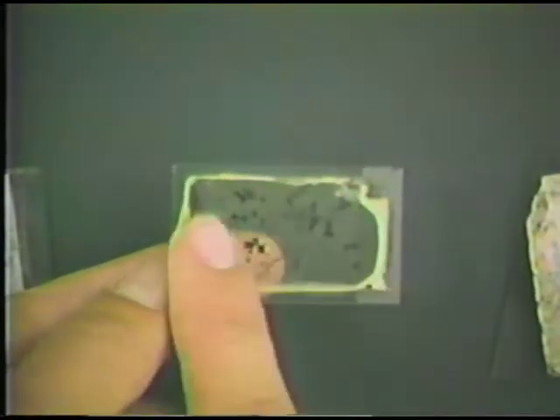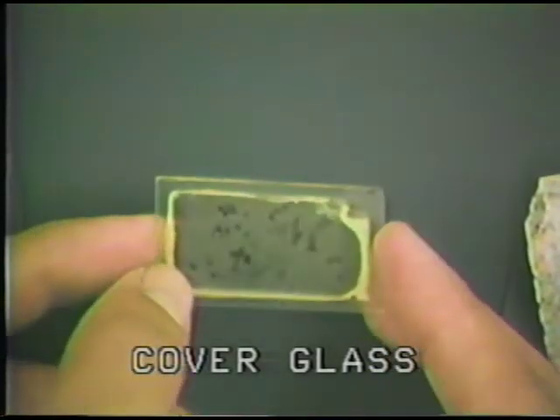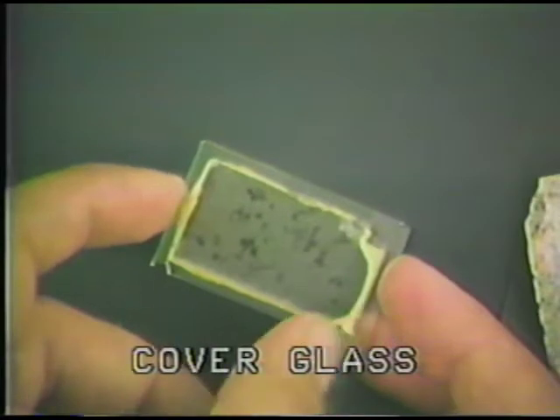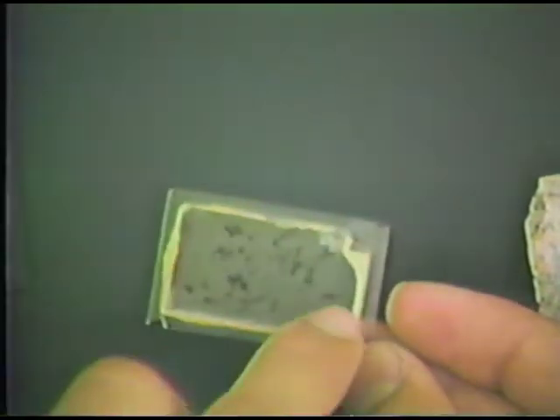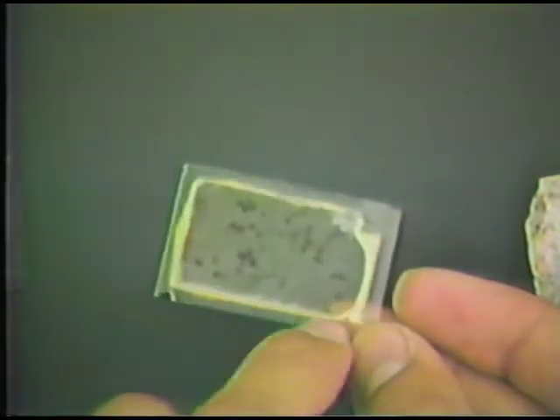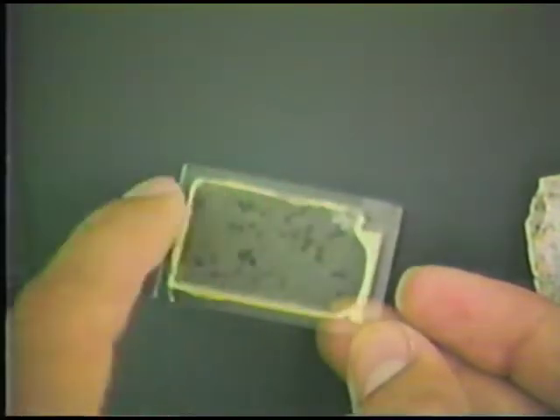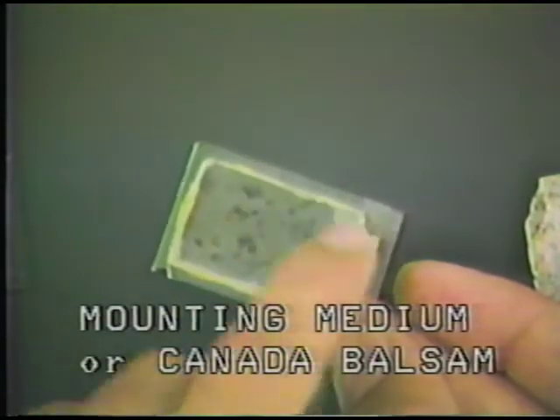The other thing about this final thin section is that there's a cover glass that makes the top surface very smooth, and that's been placed over the very thin rock slab. A mounting medium has been applied, an epoxy, or some material which we call Canada balsam, which essentially glues the cover glass to the rock specimen.